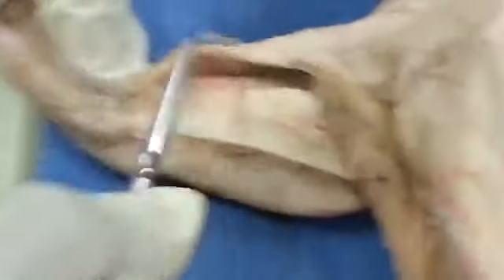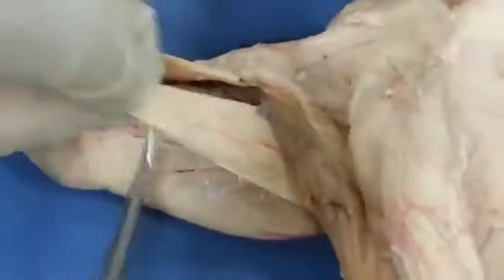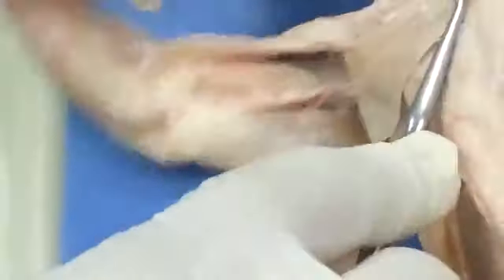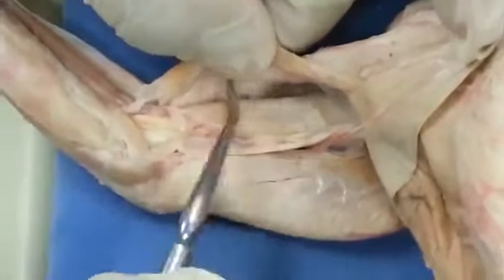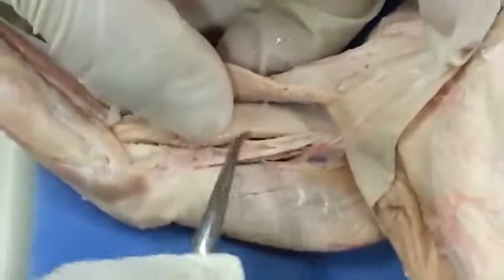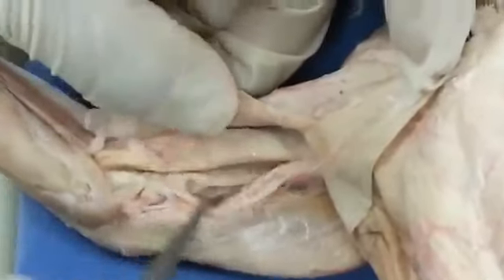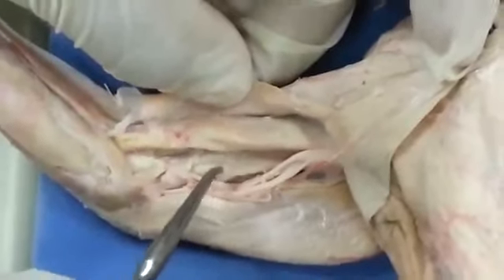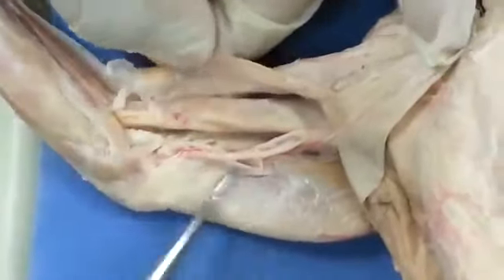And the first muscles we're going to see are the clavodeltoid, the clavobrachialis, and the epitrochlearis, which in this case would be cat specific. So we're just going to reflect that guy and go to the deeper muscles here, which you have the biceps brachii. It's going to be a synergist for elbow flexion. As we go deep to the blood vessels and nerves, you see the medial head of the triceps brachii and the long head of the triceps brachii.